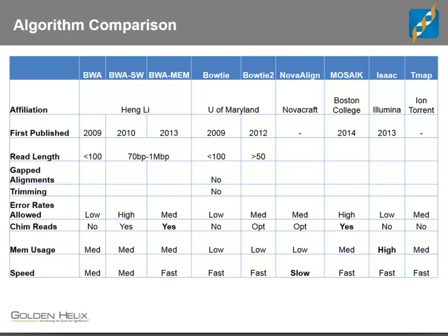Why would this happen? Well, potentially if you're doing, say, de novo transcriptome assembly, that might be happening. Also, if you're doing fusion gene detection for cancer, that might happen. If you're looking at structural variations, that might happen. So there's definitely a class of problems where that type of feature is extremely important.